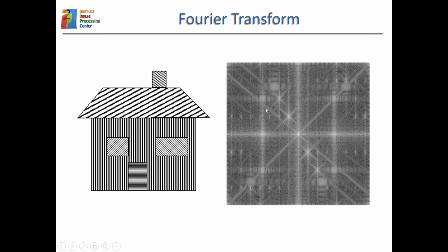And this is what I'm representing here. We are not talking for the moment about the phase shift, but just the amplitudes. The amplitudes are also called intensities, and they are related to energy, so how much energy you need from that wave.